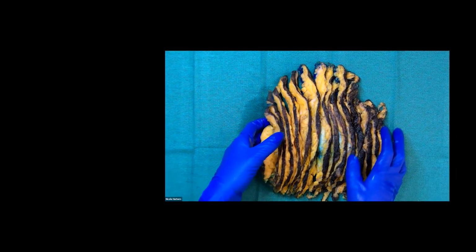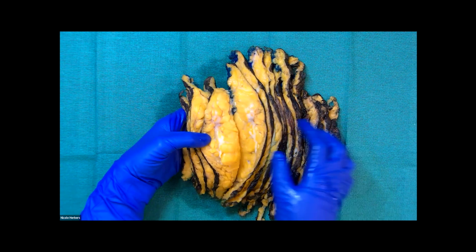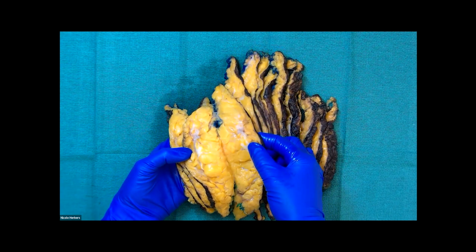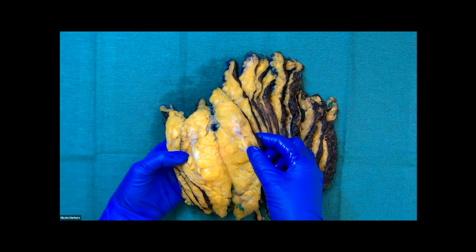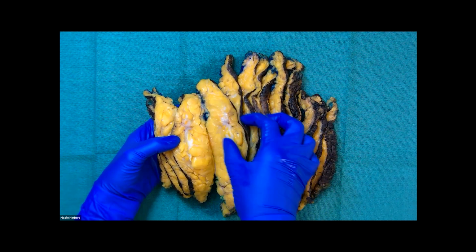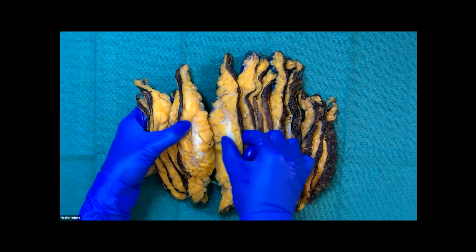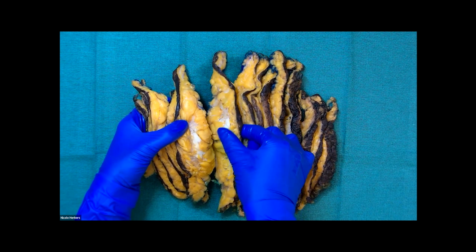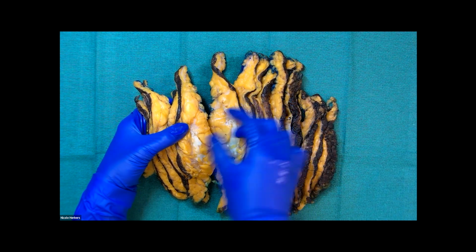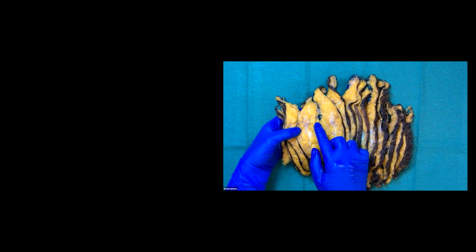And now we'll go through our breast specimen here, and I'll show you what our invasive ductal carcinoma looks like. You can see here that it has more of a stellate appearance. This firm area here, it's very firm to feel, versus the fibrous tissue that's adjacent to it right here. This is more rubbery. So that's a good indication that this is in fact my mass.